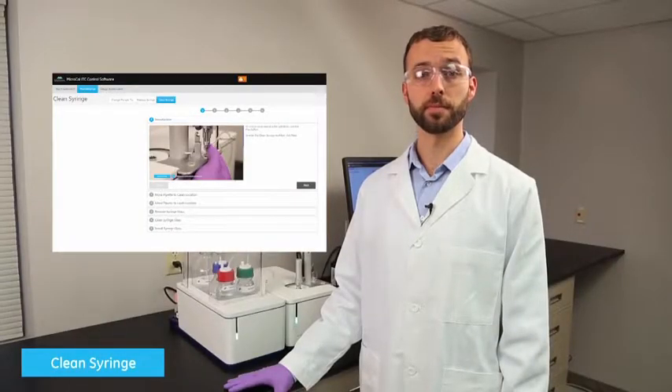I'd like to show you how to manually clean a syringe on the MicroCal ITC system using the software's guided workflows.